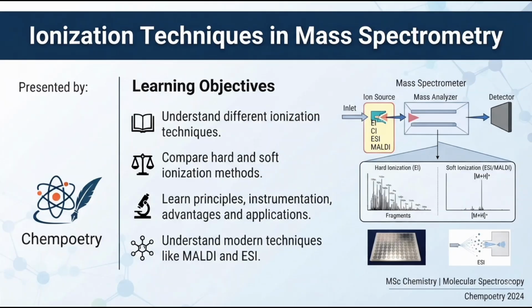In today's class, we are going to discuss a very important topic from Mass Spectrometry, Ionization Techniques. Now, before understanding different ionization techniques, we need to answer one simple question. Why do we need ionization in mass spectrometry?